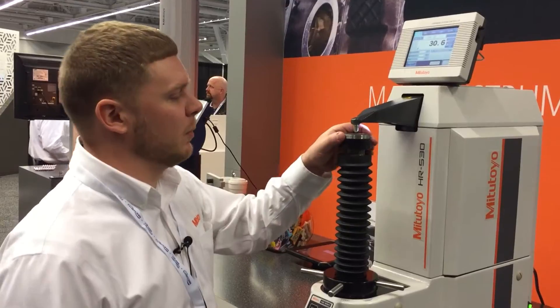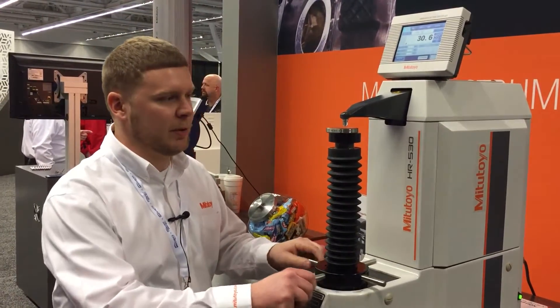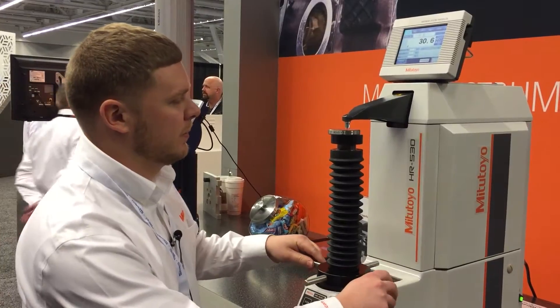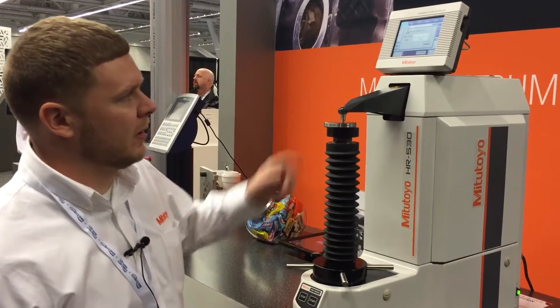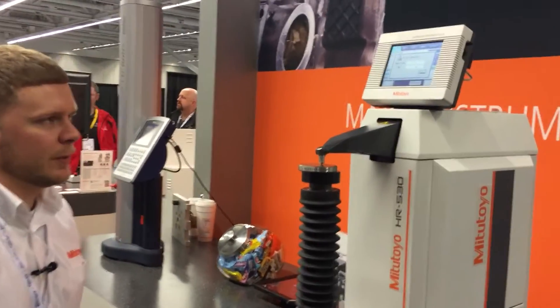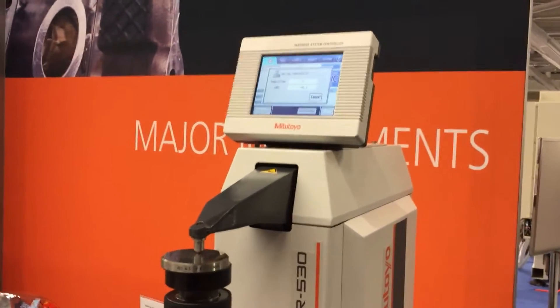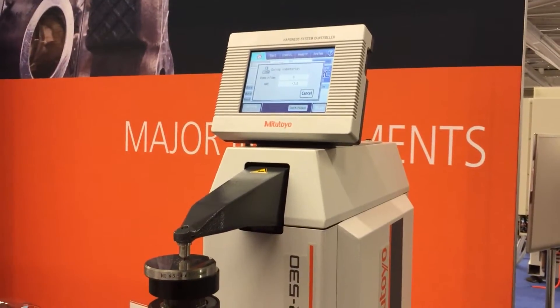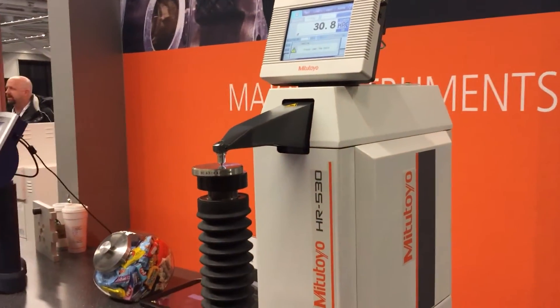Right here I'm going to show you how to use the unit. What we've got right here is a test block — I've already loaded it. I'm going to manually move the column up. You're going to hear the machine click, and now it's starting the test. We have a nice color display, and you can see it taking the indentation. Now it's done.